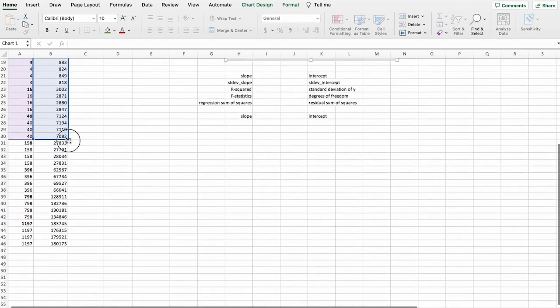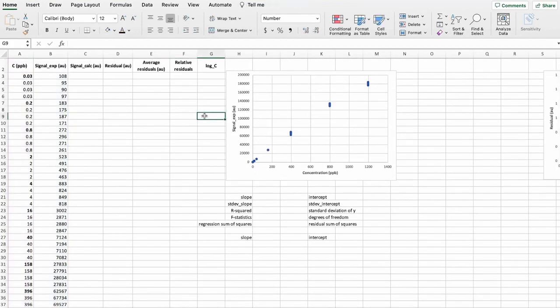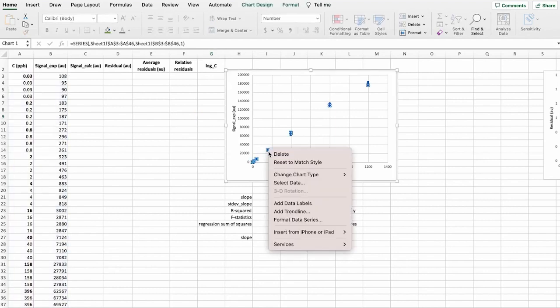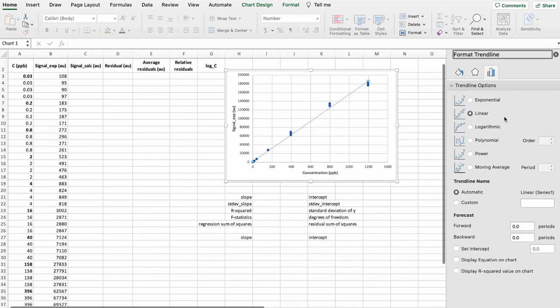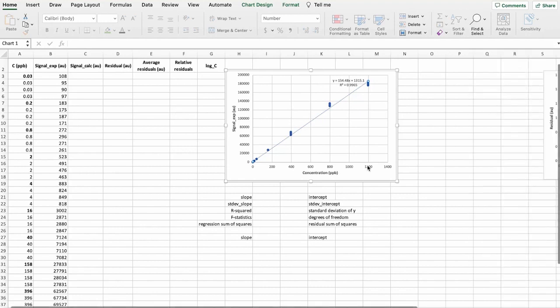So pretty usual standard graph when we are evaluating linearity or doing calibrations. And what we also do is let's add a trend line here, a linear trend line. And also let's display equation and r-squared value.